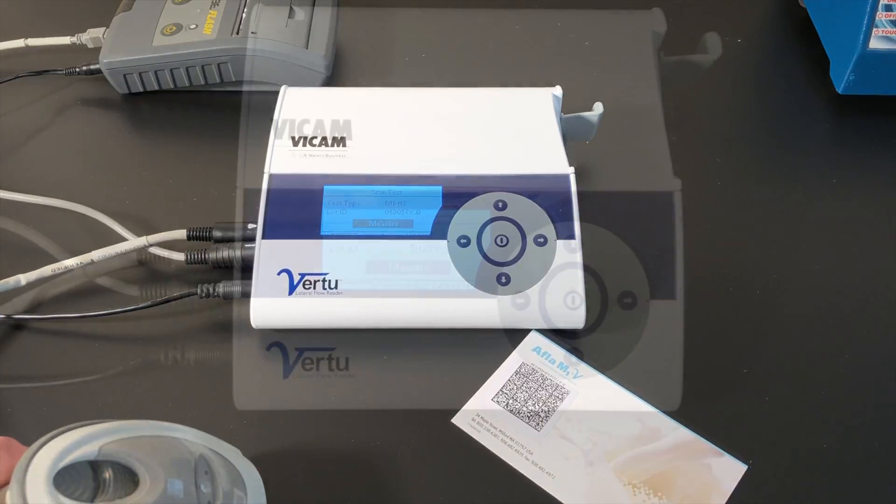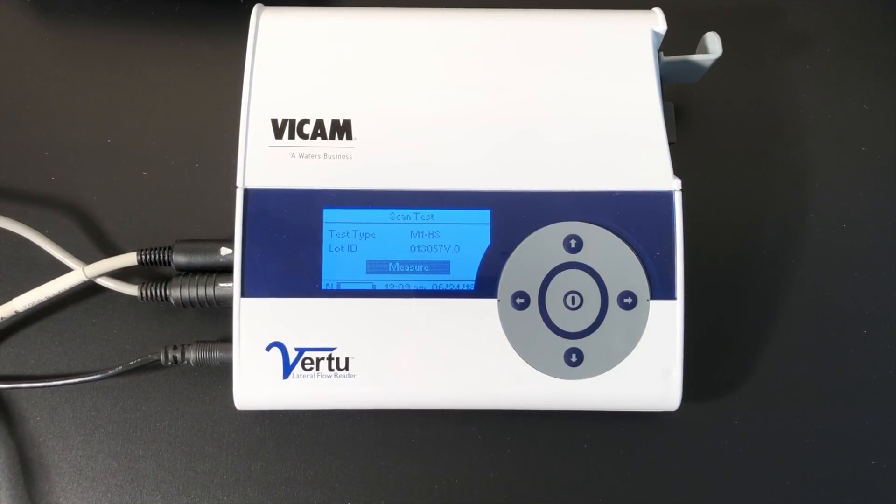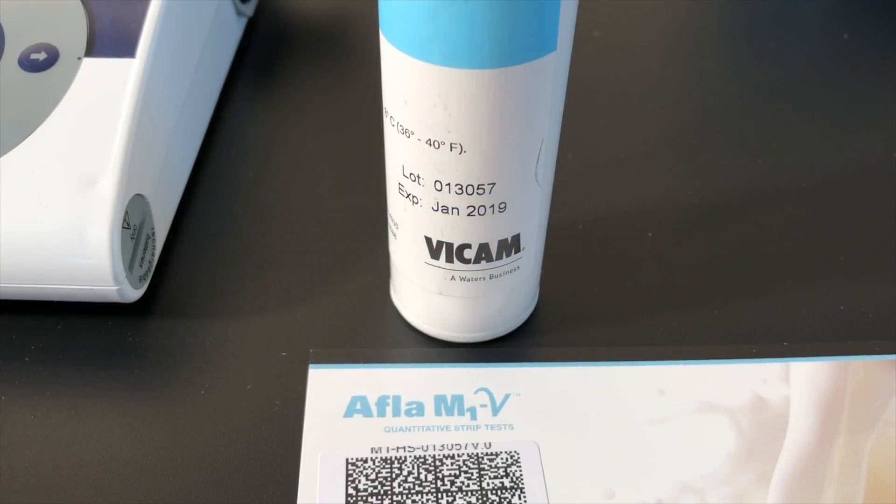Each lot of Strip Tests includes a calibration barcode. Scan the barcode. The Virtu screen will show the lot number, which should match the Strip Test label.